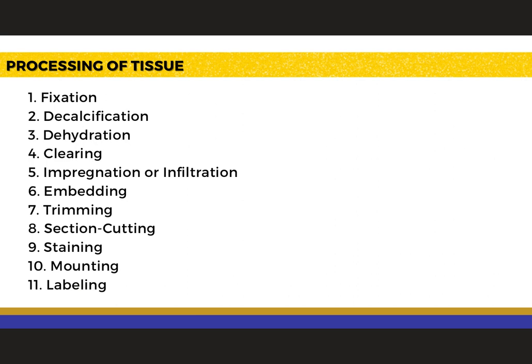So for the processing of tissues, please remember that a better and more effective means of studying tissues is by examining their sections and smears which have been permanently preserved, stained for demonstration of specific structures, and mounted on glass slides with cover slips for permanent keeping.